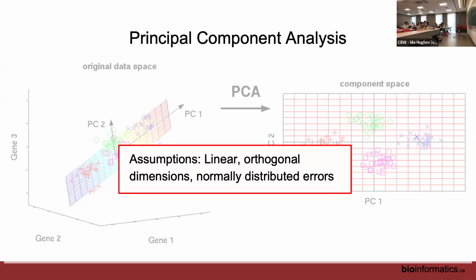We do have a follow-up question in the Slack. Let's say I'm interested in cell cycle signaling. If the goal is noise reduction, wouldn't it make sense to remove or reduce dimensions not related to cell cycle genes, but leave those related ones, quote, unreduced, so we can still examine their individual response? Yes, that absolutely makes sense.